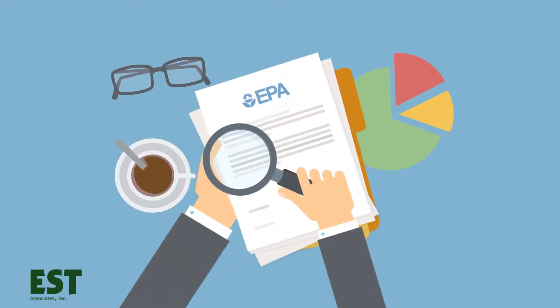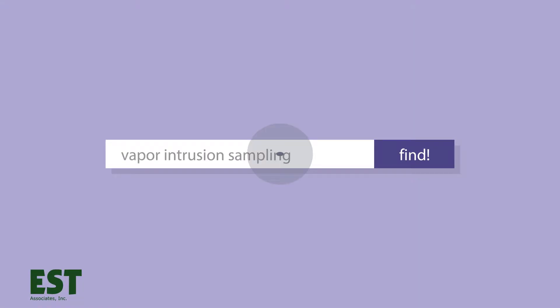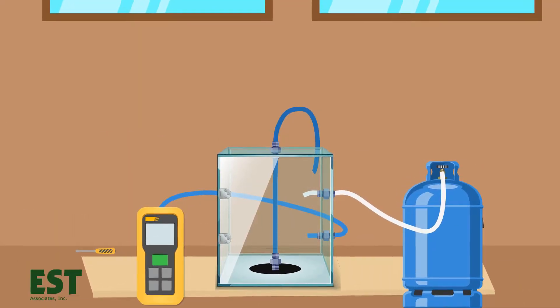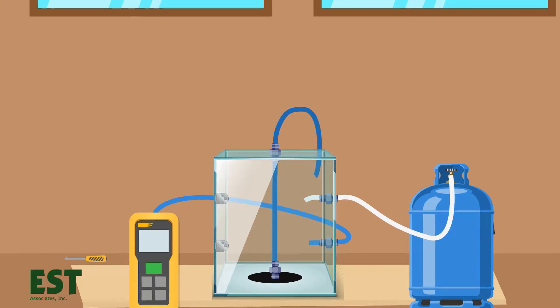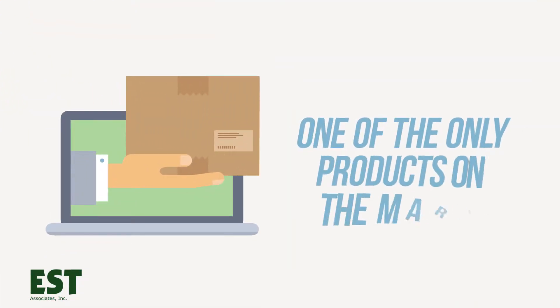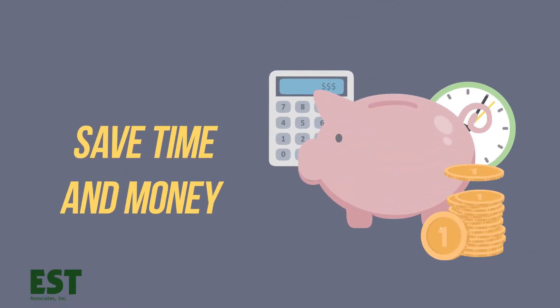Following EPA requirements and state regulations, EST has designed a new product to assist with vapor intrusion sampling. If you are a scientist or engineer that collects sub-slab samples, EST's Vapor Shroud can simplify your sampling process. It's one of the only products on the market specifically designed for SVI sampling, and it will save you time and money while maintaining sample integrity.